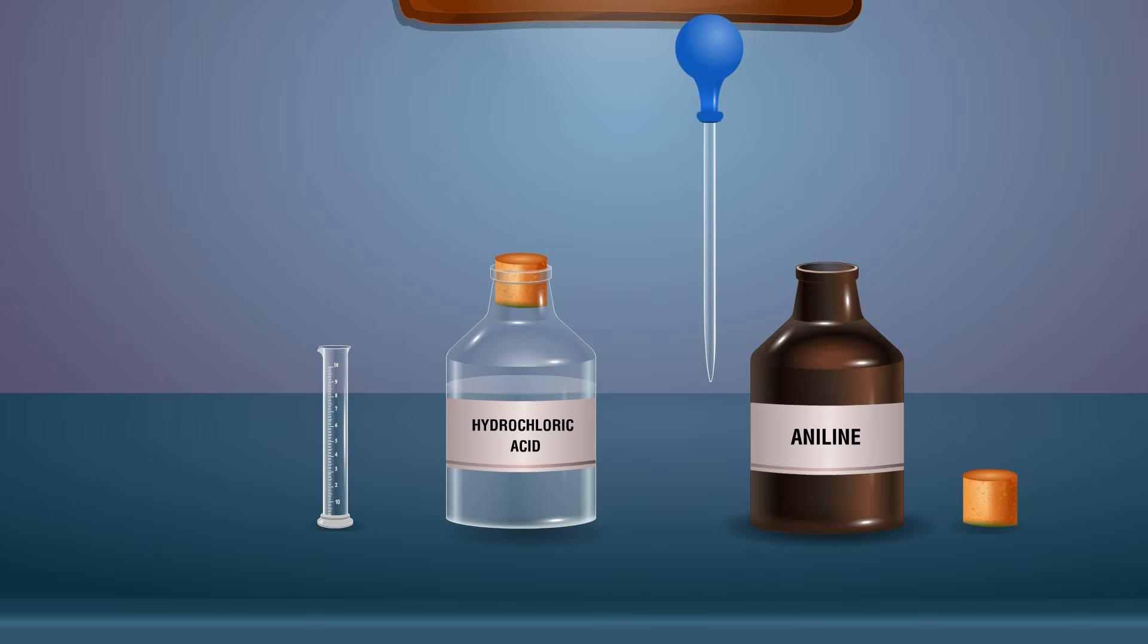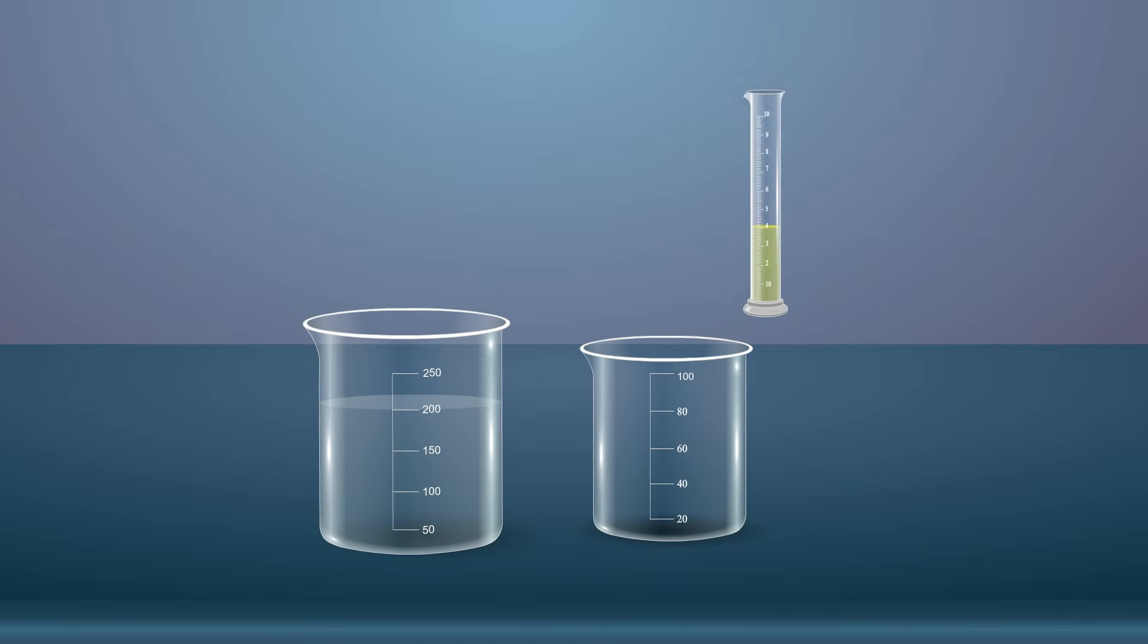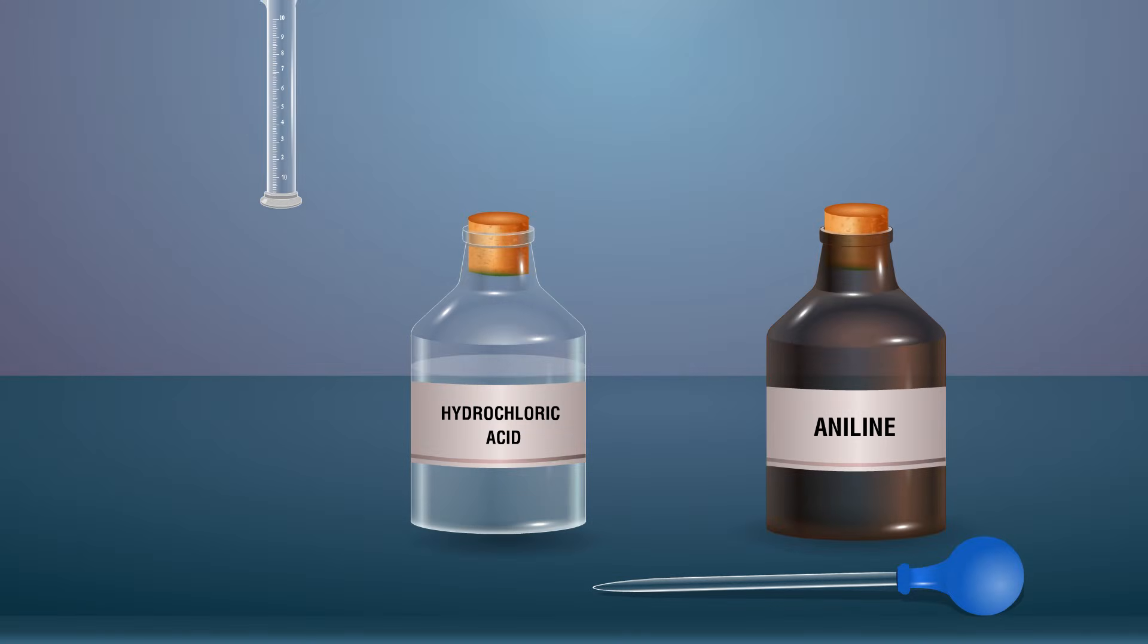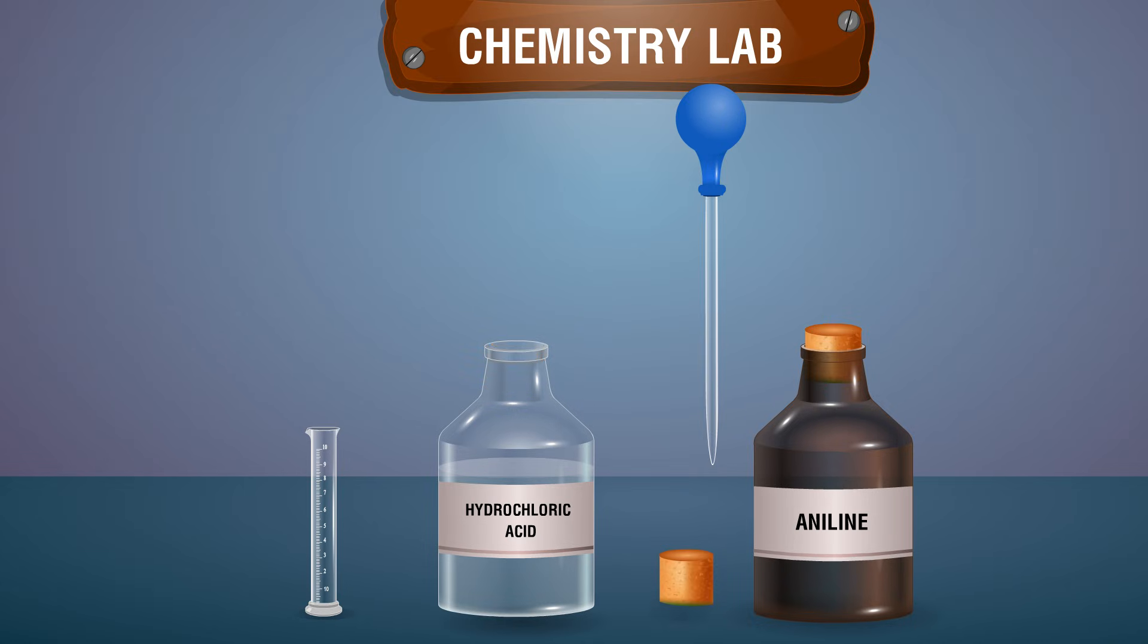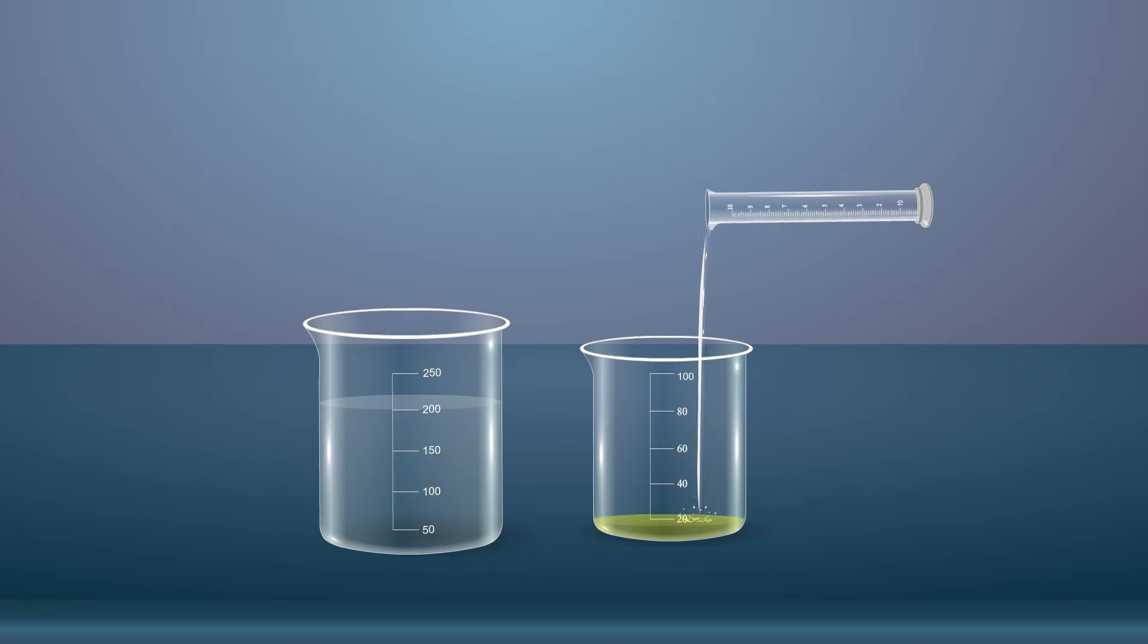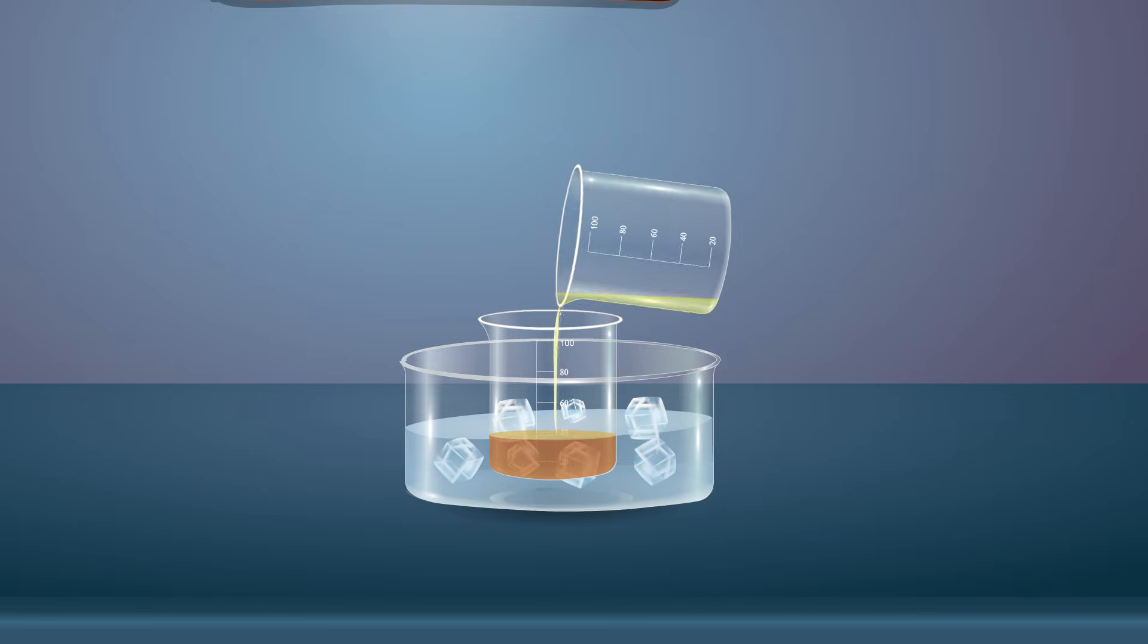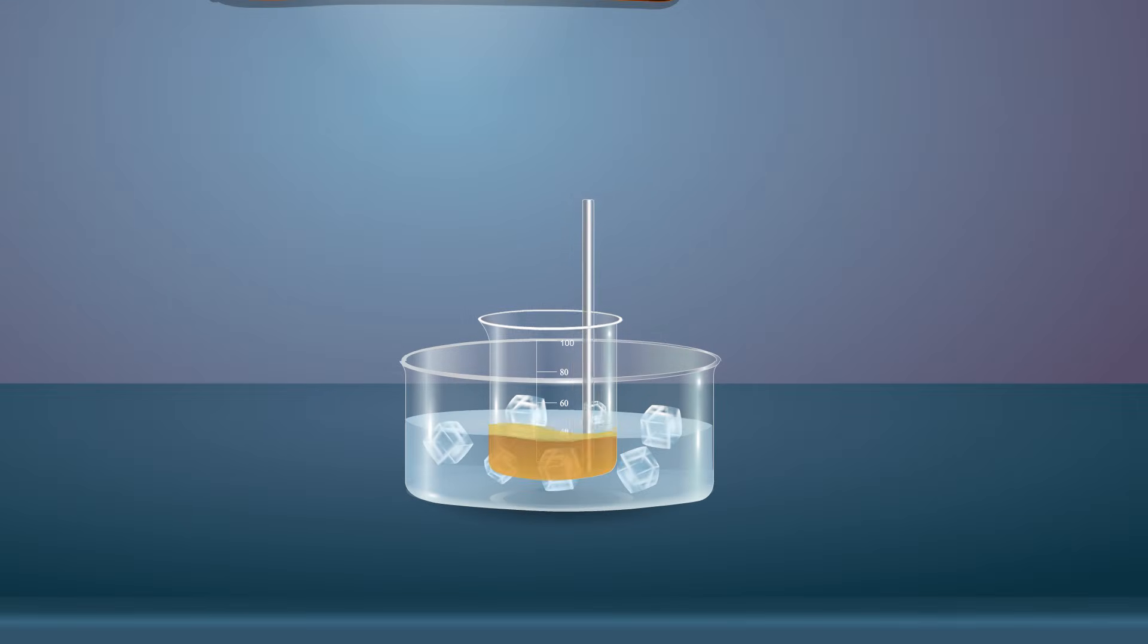Take 4 milliliters of aniline using a dropper, transfer it into a measuring cylinder and pour it into the beaker. Take 4 milliliters of hydrochloric acid with the dropper, transfer it into a measuring cylinder and pour it into the beaker. Mix the aniline solution to benzene diazonium chloride solution slowly by stirring constantly with a glass rod back to yellow color.